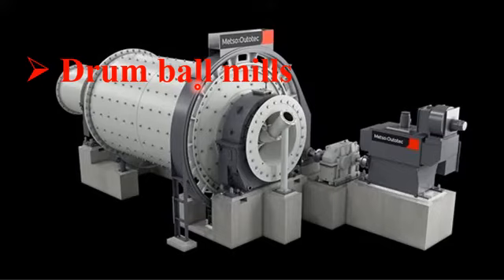Dear student, this means that there are three different separation grids which can be used and which are also available. So in a drum mill, the pre-crushed sample is placed inside the drum with a grinding ball, and the grinding ball has a diameter of 10, 20 or 30 millimeters, and this grinding ball crushes and converts the bulk material into very fine nanoparticles.